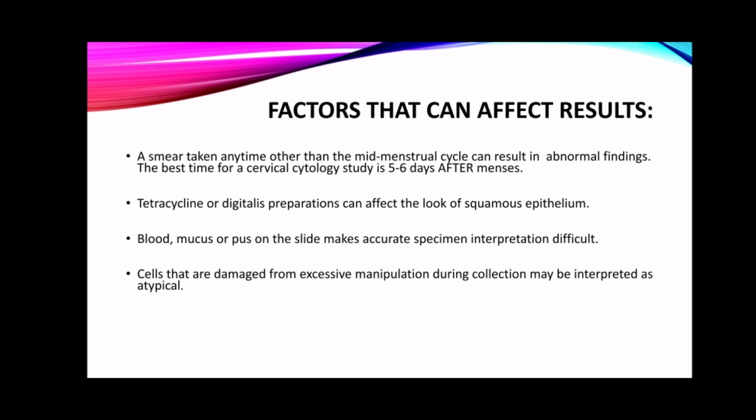Take note, class, to avoid fixation delay, have the fixative bottle open before preparing the smears. For proper fixation, if spray fixative is used, the slide should be kept at a distance from the sprayer. Approximately how far is it? 12 inches away. Medications such as tetracycline or digitalis preparations can affect the look of squamous epithelium. Blood, mucus, or pus on the slide makes accurate specimen interpretation difficult. Cells that are damaged from excessive manipulation during collection may be interpreted as atypical.